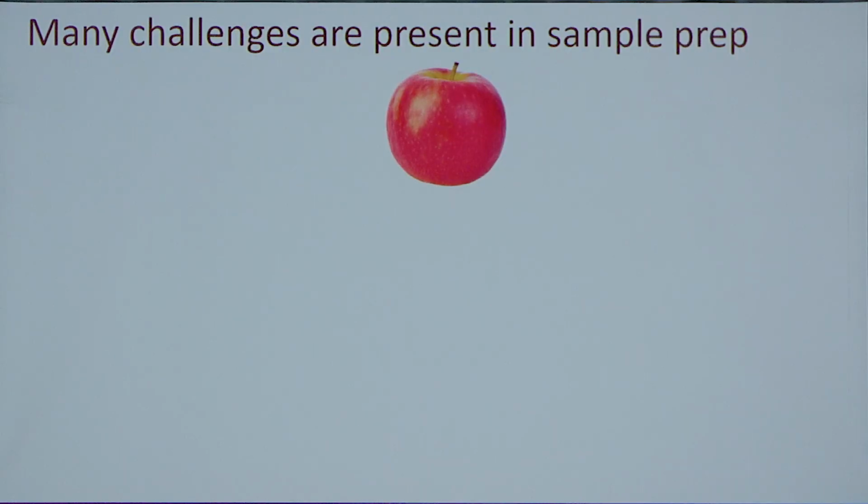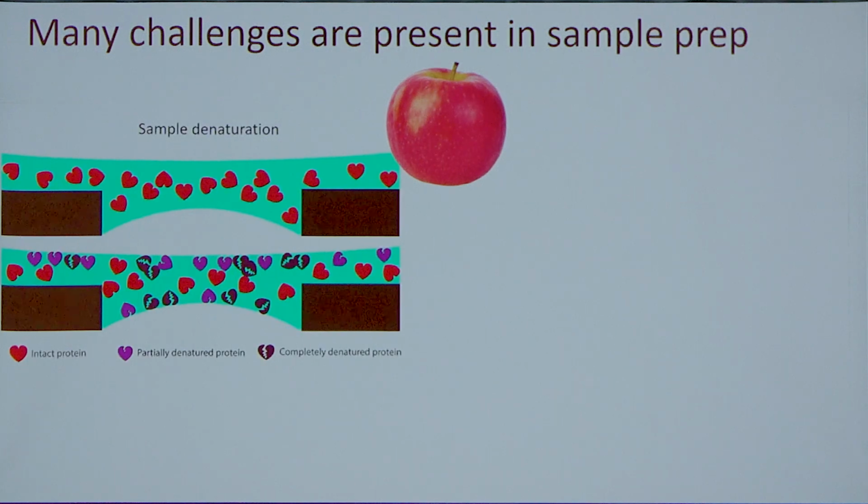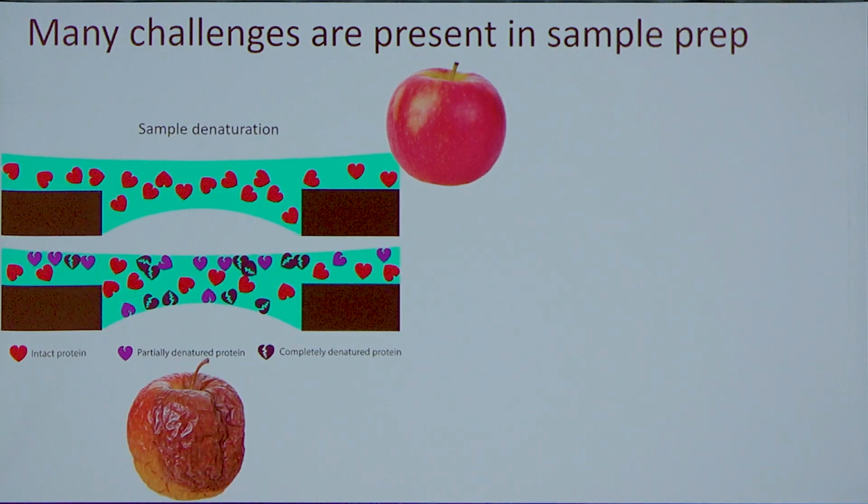And then there are many challenges during the sample preparation for electron microscope. You need a lot of pictures first, and then you need all of your protein or sample of interest to be inside a thin layer of ice, and it forms something that we call the air-water interface, which is huge compared to the size of the molecules, and most of the time they touch that air-water interface, as people call it, the deadly touch, and they get denatured like a rotten apple.